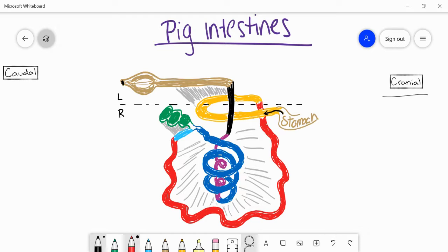So if we start with the cranial end, food will be in the stomach and the portion of the stomach that is the most distal end right around here is called the pyloric region of the stomach and this is going to be a different type of epithelium than what we're going to have in the intestine.